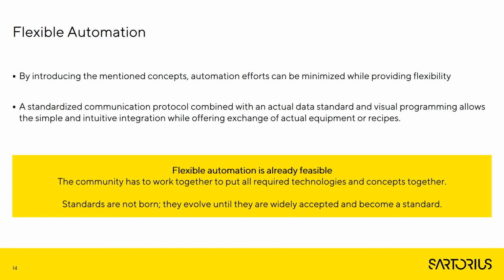Now I want to come back to the initial concept of flexible automation. It can be said that by introducing the mentioned technologies, like plug and play and scientific data standards, the automation efforts can be reduced while providing flexibility. A standardized communication protocol combined with an actual data standard and visual programming allows a simple and intuitive integration while offering exchange of actual equipment or recipes.